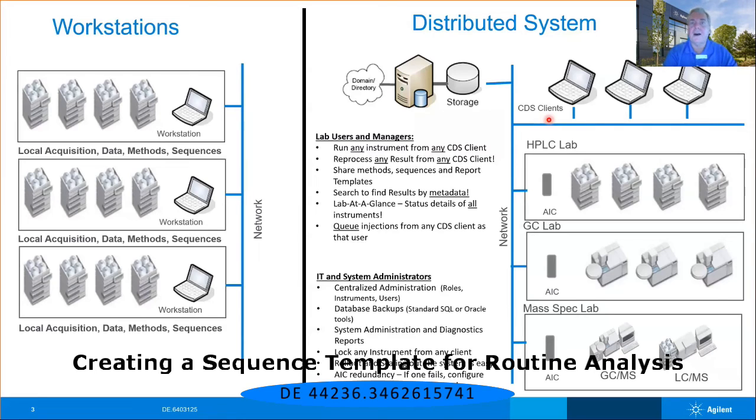However, let's give an example of ChemStation. If you want to do that in ChemStation, then you need to purchase an offline copy of ChemStation, which is about $4,000. And as soon as I give them the price tag, they say, forget it. Nobody in the organization is ever going to give me $4,000, so I don't have to walk into the lab.